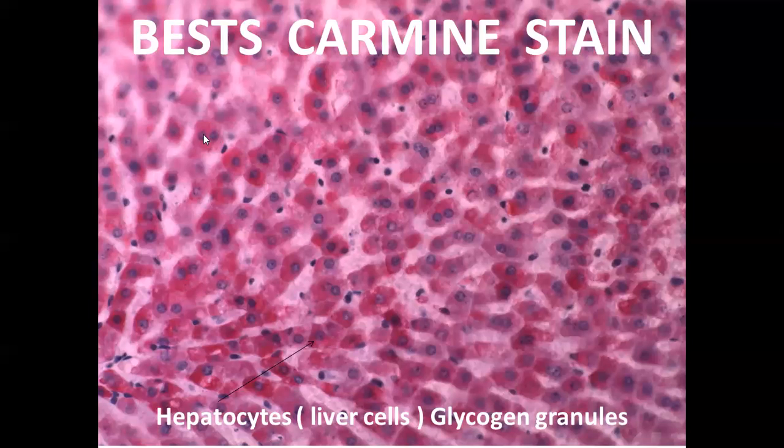Cells of bone, osteoclasts for example, have more than two or three nuclei, multinucleated, but the hepatocyte is binucleated, two nuclei. This is about the shape and some information about the liver cell.